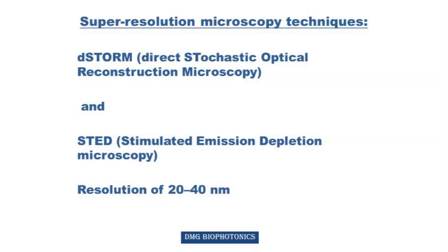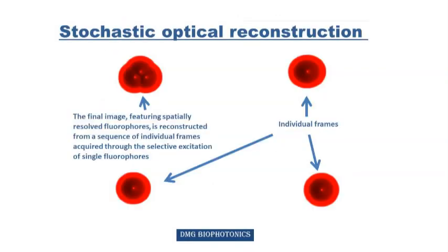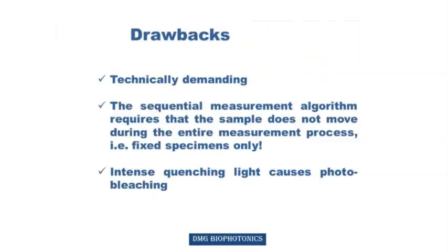Newly emerged super-resolution techniques like dSTORM and STED have pushed resolution into the tens of nanometers. These methods rely on selective excitation of individual fluorophores and mathematical reconstruction of the resulting image. The idea behind these methods is simple. Excite fluorophores, preferably one at a time. Capture each image and reconstruct a high-resolution composite image.